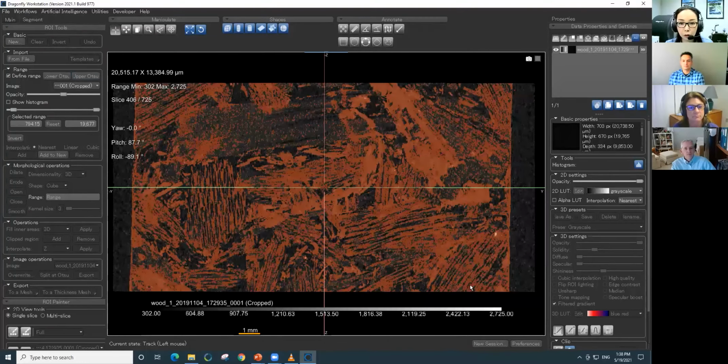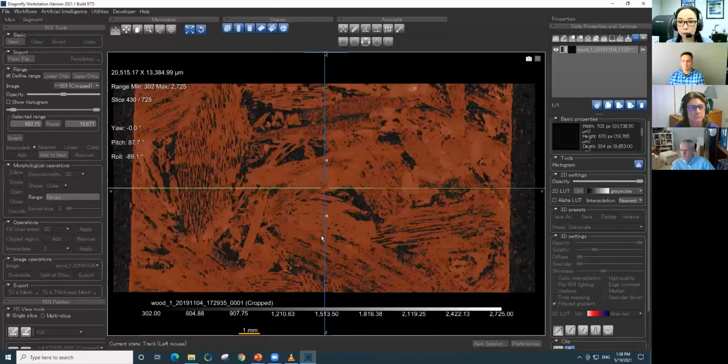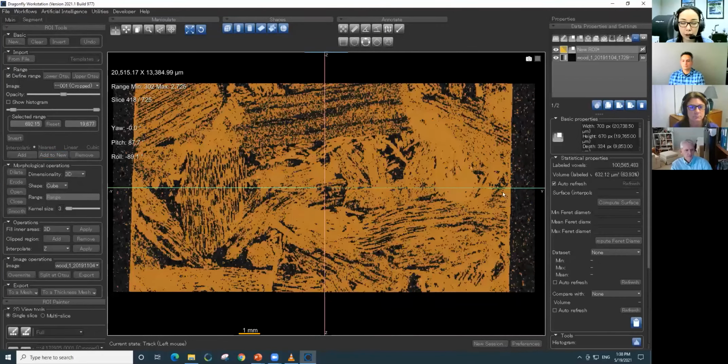It's probably under-selecting a little bit, so let me adjust it. That's probably reasonable. And we're going to just calculate the total of those wood selected pixels. So I'm not going to care too much about the little pieces or details and just name this as wood.